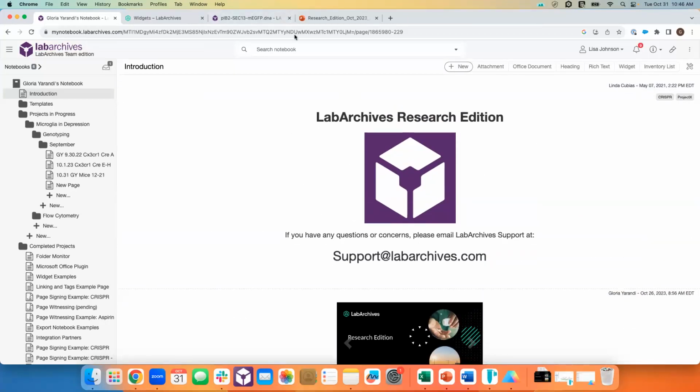So with that being said, we have plenty of time for questions. Are there any questions about what we talked about today? We talked about a lot. We talked about the templates, we talked about the widget manager and how you create a custom widget, and also we talked about our integration partners, which are SnapGene and GraphPad Prism.